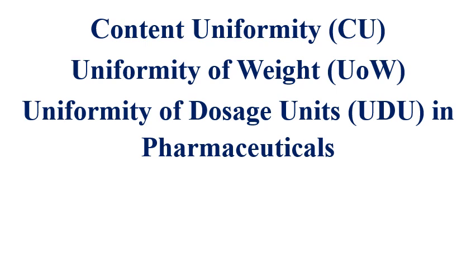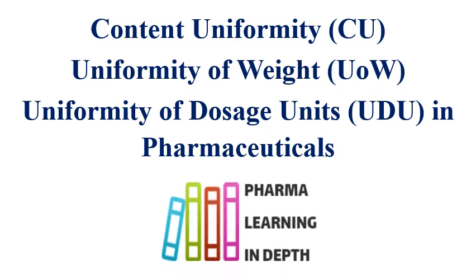The present video is for understanding content uniformity, that is CU, uniformity of weight, UOW, and uniformity of dosage units, that is UDU. This test is required to ensure that every tablet, every capsule, or every dose of the formulation complies with the quality, complying with the label claim.